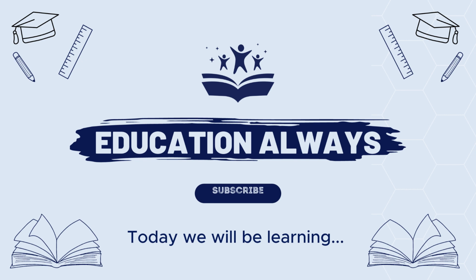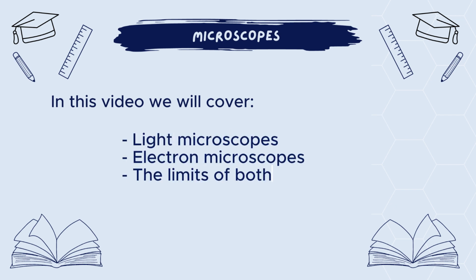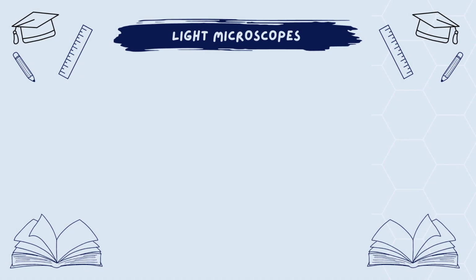In today's video, we'll be looking at microscopes. This will cover light microscopes, electron microscopes, the limits of both types, magnification and a test at the end.